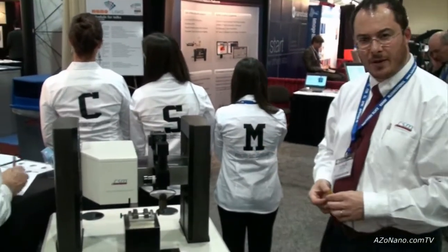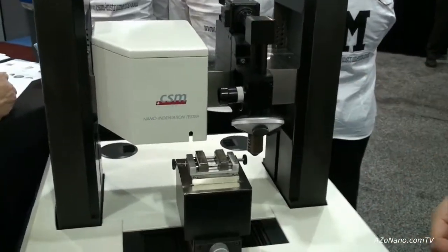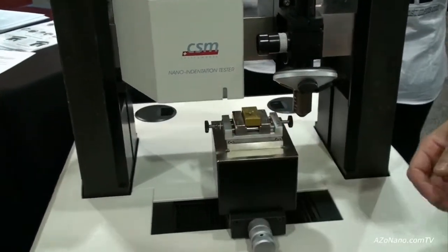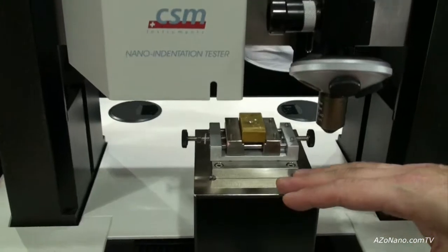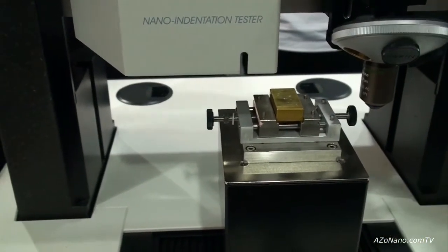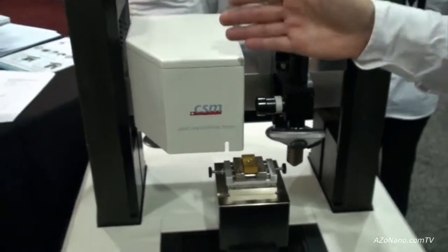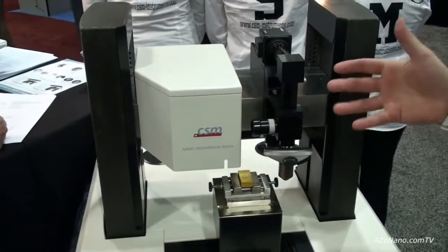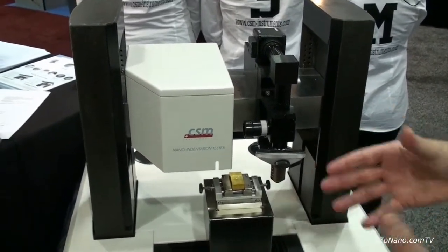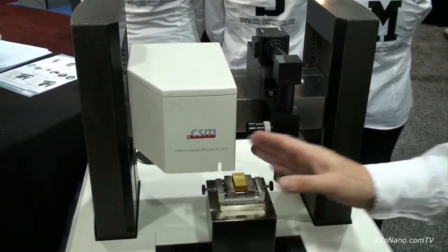This is our compact platform — the smaller of our two platforms, the other being the open platform. As you can see, you put the sample onto your sample holder. This is an XYZ translation stage, so the sample can move under any of the modules. In this case we only have two modules: the optical video microscope and a nano-indentation tester. But you could have three or even four modules on here, depending which modules you choose.